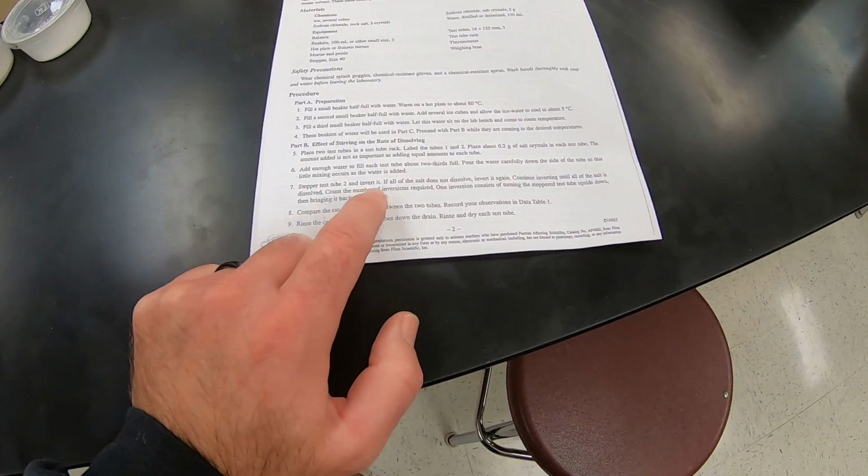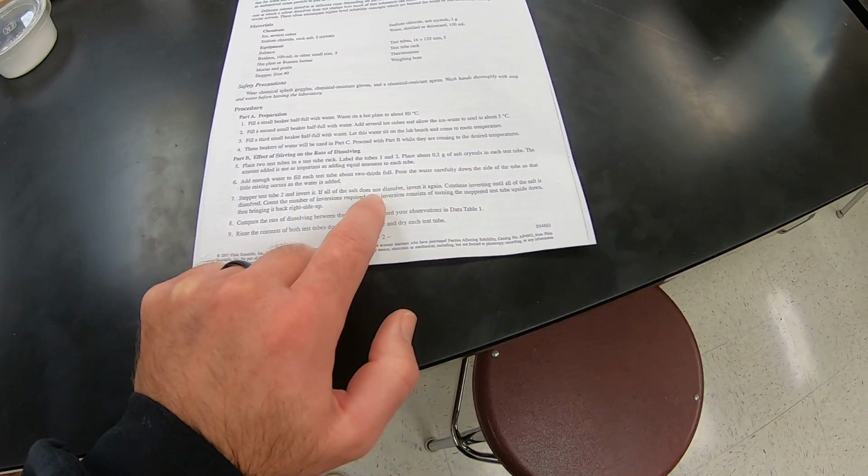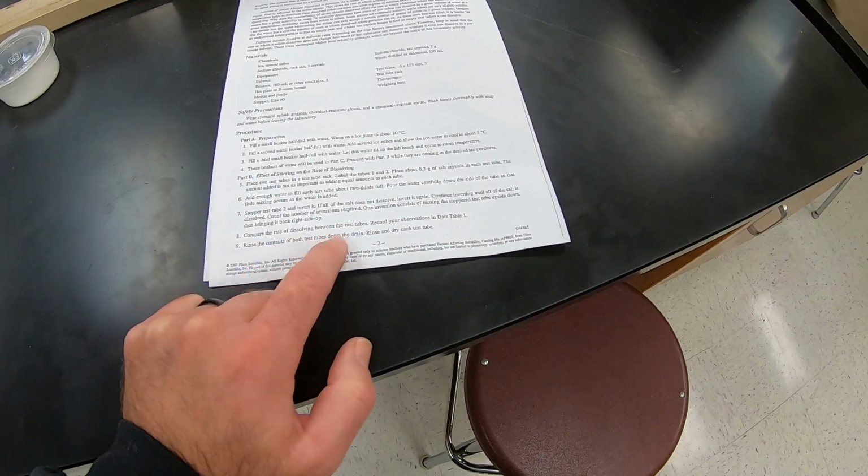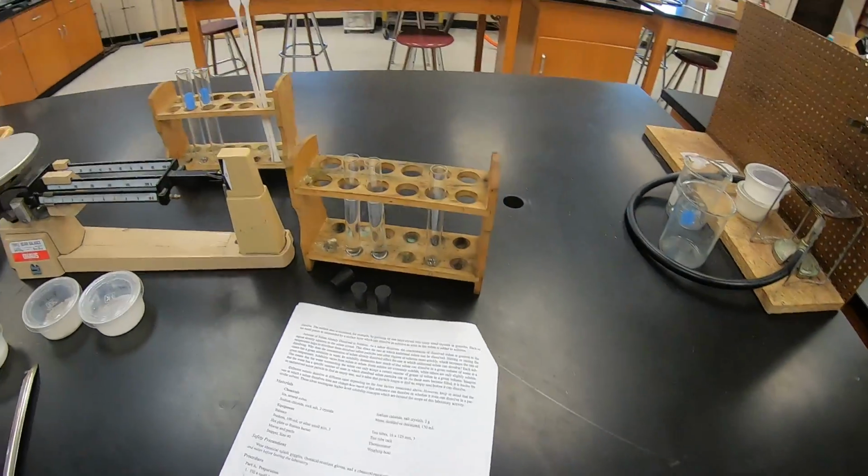Stopper test tube number 2 and invert it. If all the salt does not dissolve, invert it again and count the inversions. Compare the rate of dissolving between the 2 tubes. The other tube we're not going to do anything to.